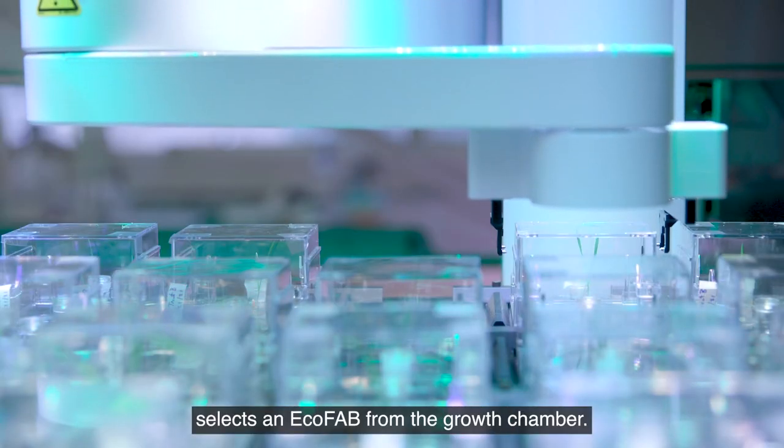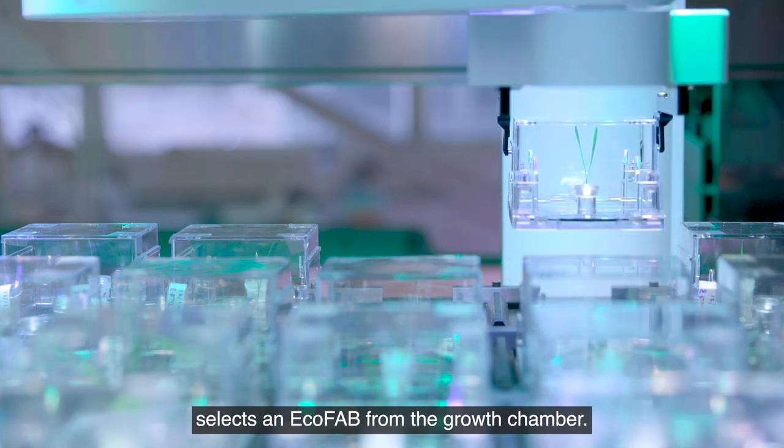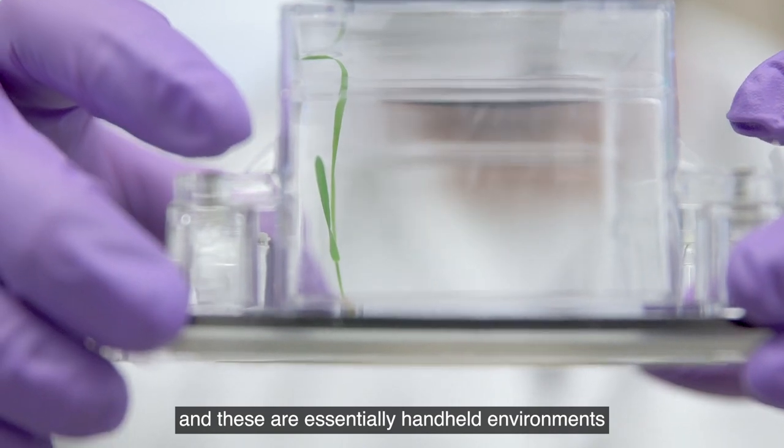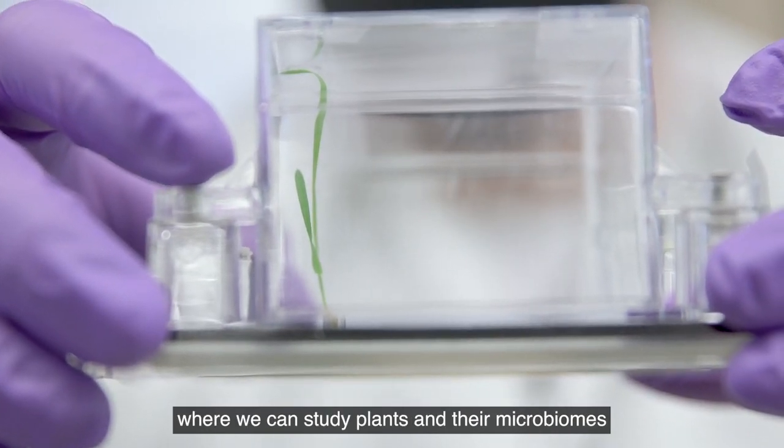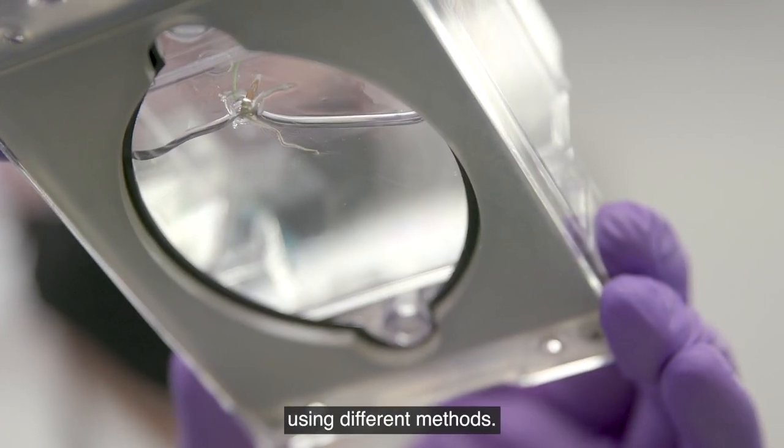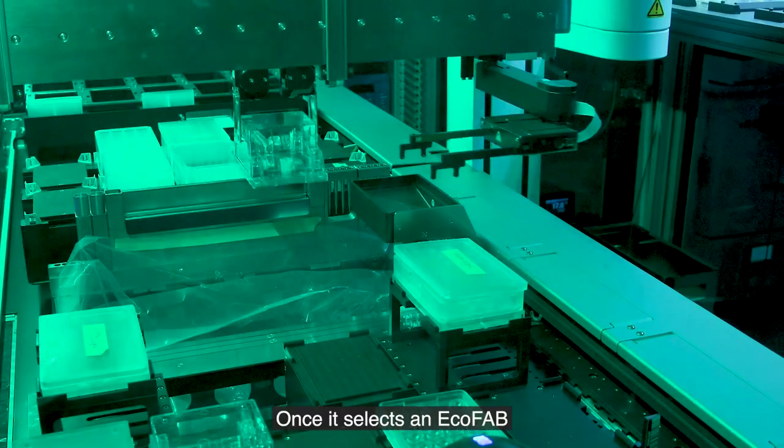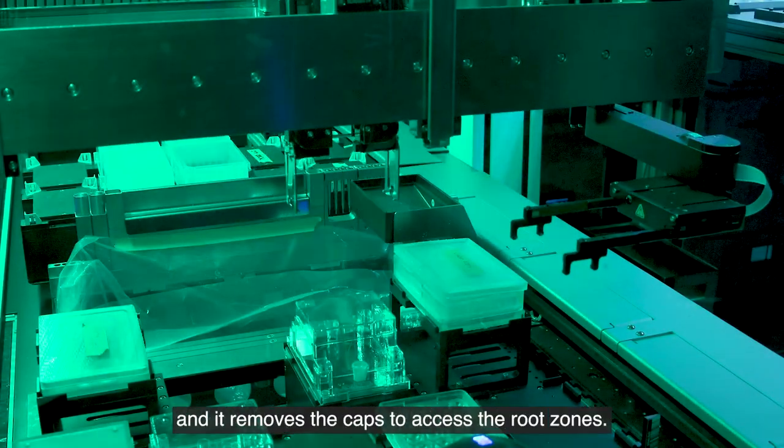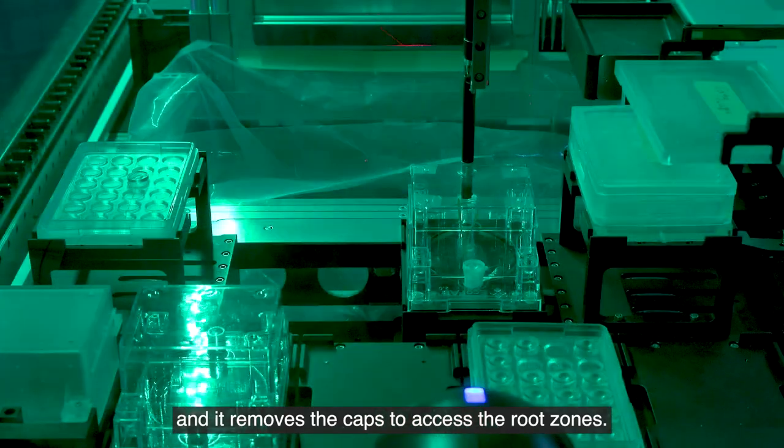First, the ECOBOT selects an ECOFAB from the growth chamber. ECOFAB stands for fabricated ecosystem, and these are essentially handheld environments where we can study plants and their microbiomes using different methods. Once it selects an ECOFAB, it delivers it to the liquid handling unit and removes the caps to access the root zones.